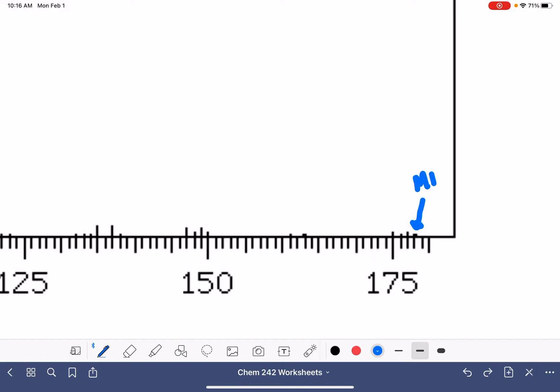That's really big. This is our M plus two peak. So that makes this guy our M plus peak, which is 176.